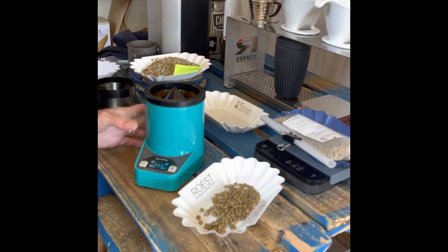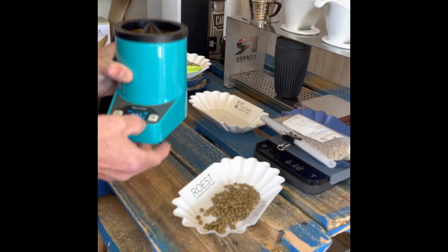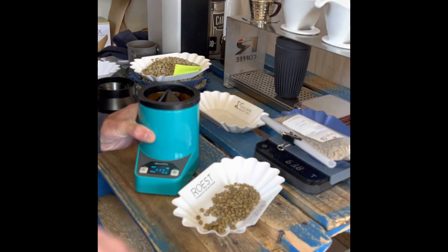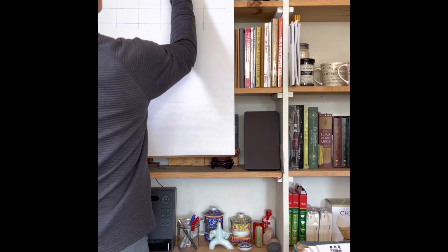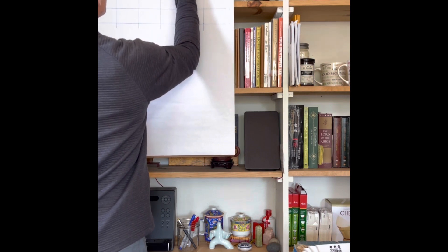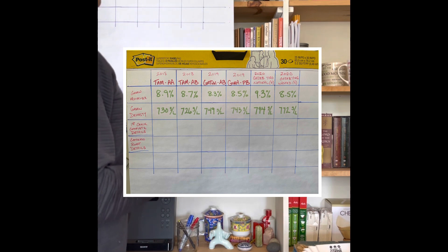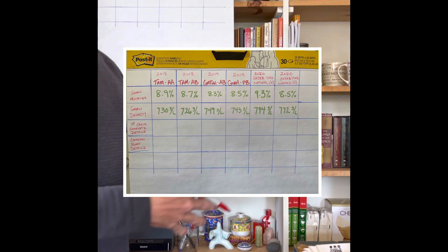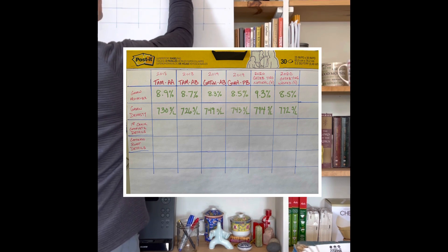The third reading says 'measuring, do not move' — that one came in at 9.4% and 799 g/L. So our average is 9.3% moisture at 794 grams per liter. Grams per liter is a density measurement — it's how many grams are in a liter. Originally density was this concept of displacement: when you throw a stone in water, it displaces a certain amount, and the more dense the stone, the more water it displaces. That's where the density concept comes from.